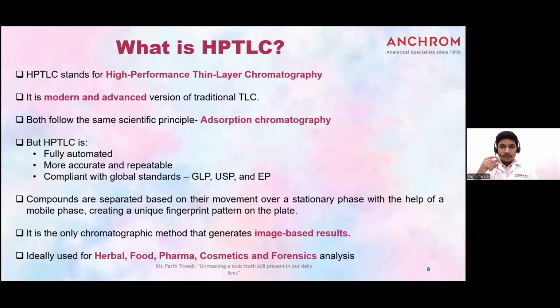It separates compounds using a stationary phase with the help of your mobile phase. At a certain stage, if required, you can even derivatize and check the fingerprint analysis on your plate. The important thing, on the second last point, is that it is the only chromatographic method that generates image-based results. As you know, we mainly believe when we see anything. It is ideally used in herbal, food, pharma, cosmetic, and also in forensic.